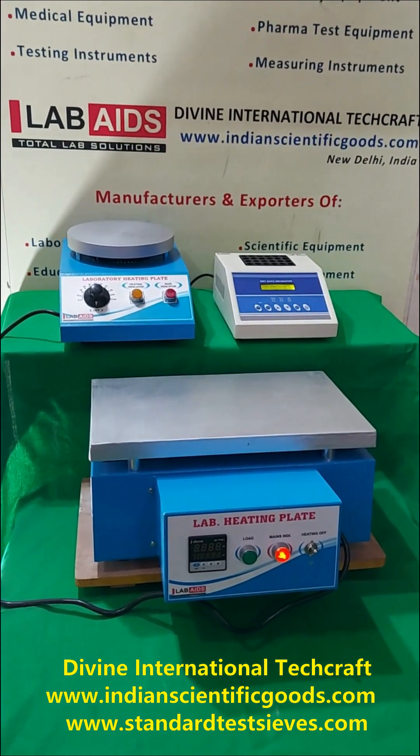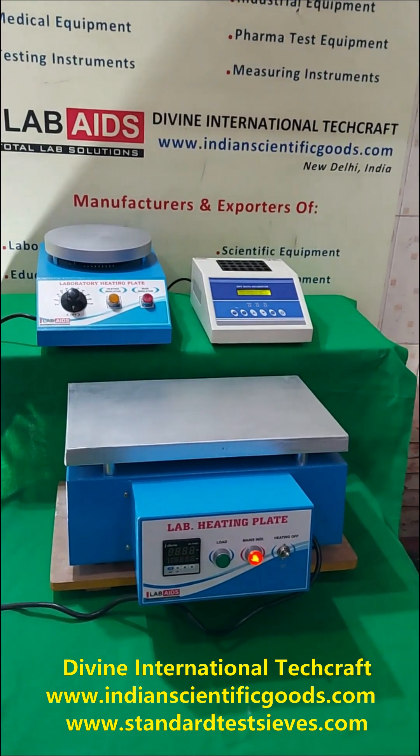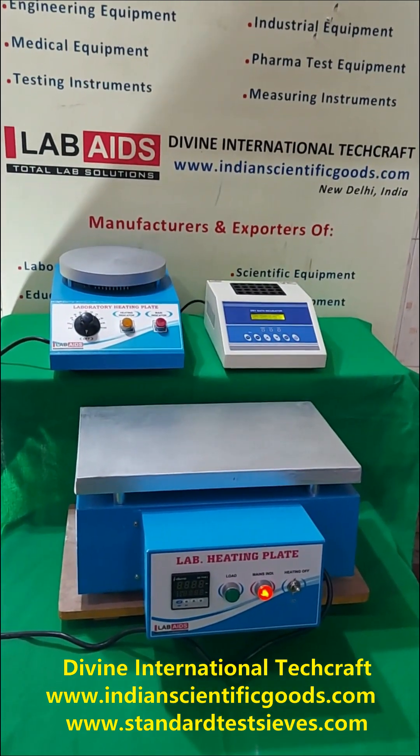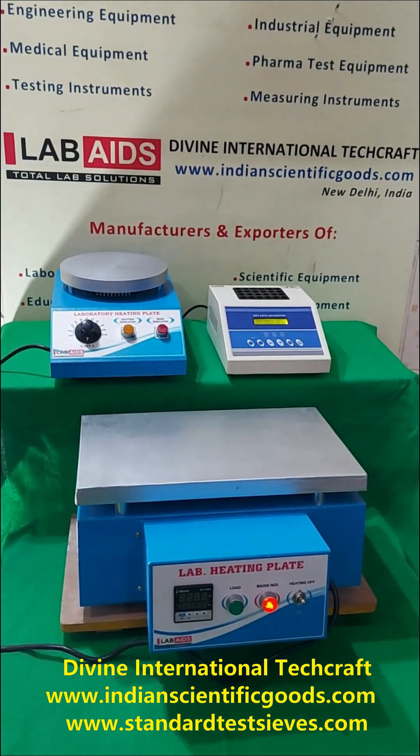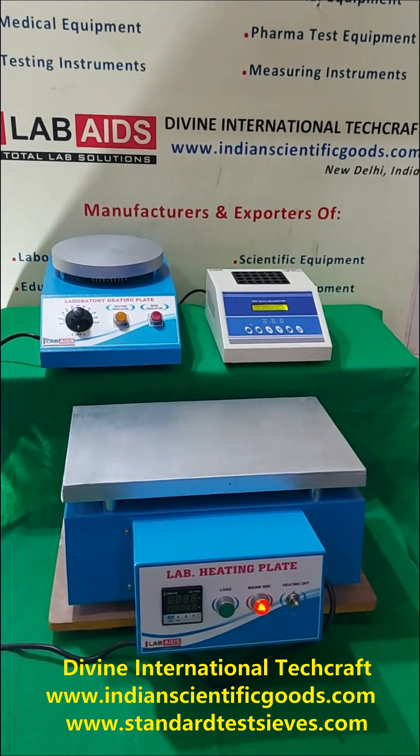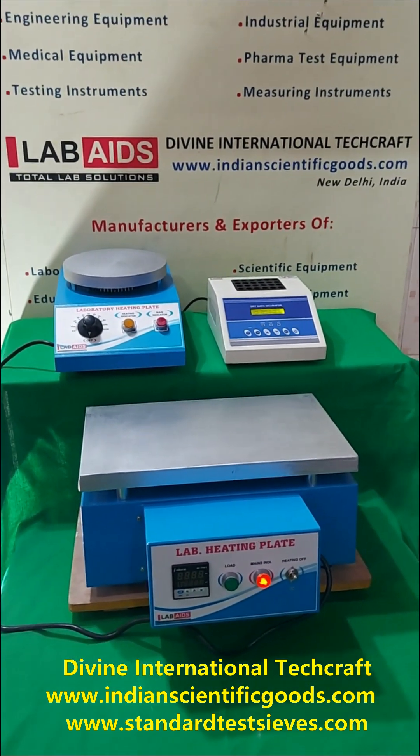Hot plates or heating plates are an integral part of any laboratory and are used for heating various types of samples. Whatever be the size, shape or quantity of your sample, we have a hot plate to suit your every requirement.